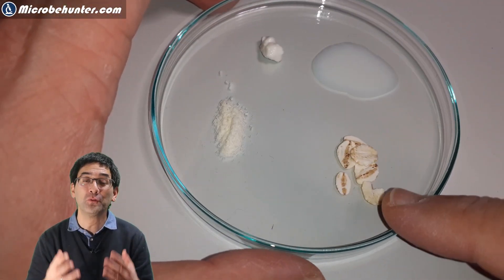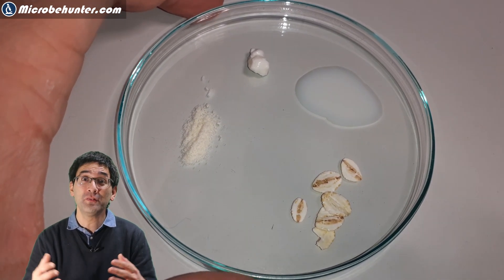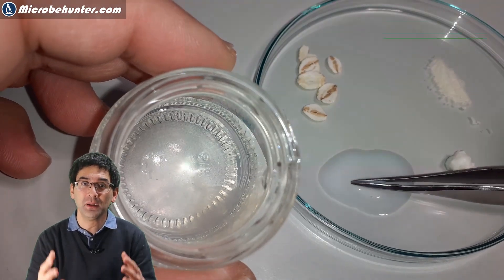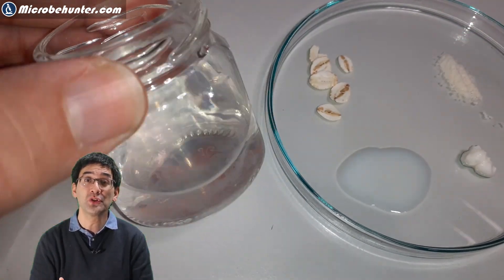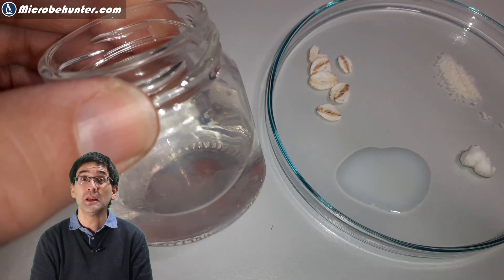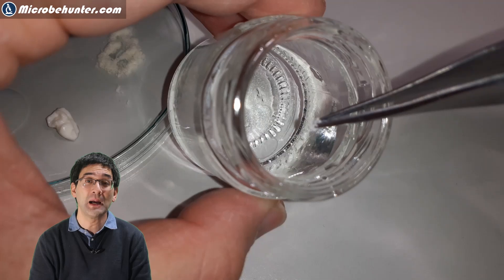What you have to do is feed the ciliates in the water sample, and there are various food sources that you can use. I've used, for example, milk — that's the one I'm adding right now — also milk powder, yogurt, oats, even a crushed wheat grain, or maybe even yeast. What I've done here is simply add a small amount of food to a water sample.